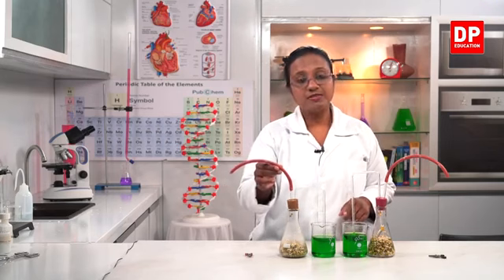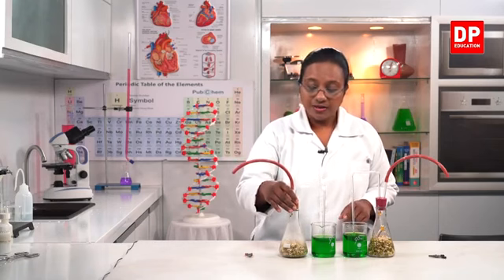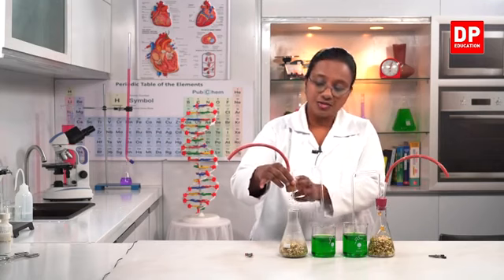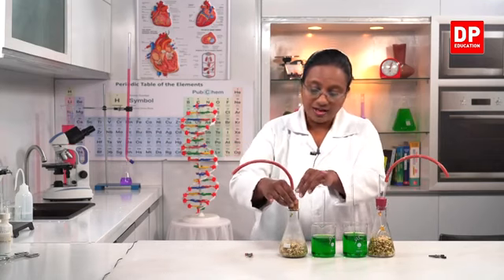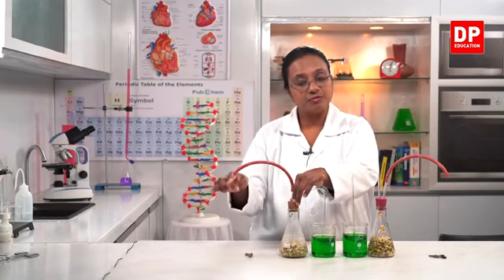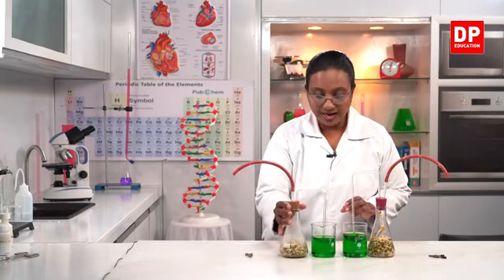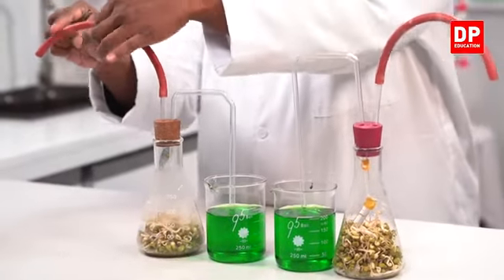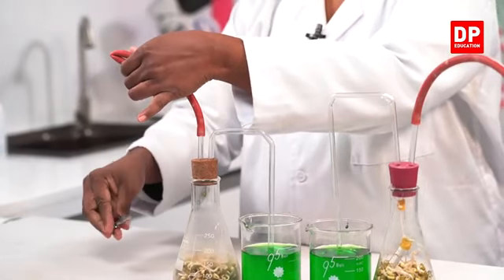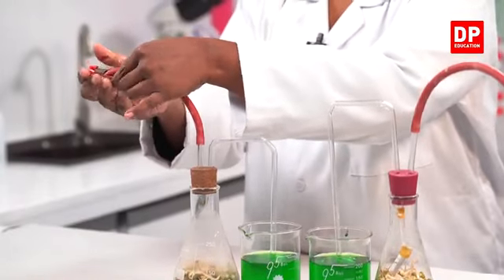Now the purpose of this rubber tube is that when I fix this to the conical flask, what will happen is, before I fix, I will show you all, it's only the two tubes that are there. There is no other container there. So when I fix it like this, there is a lot of air inside. The air can escape through this rubber tube, and once we fix it and make it airtight, we have to fold this tube, and we can either tie it very tightly with a thread, or else we can put this crocodile clip so that it is airtight.